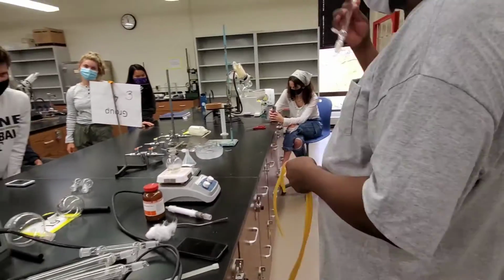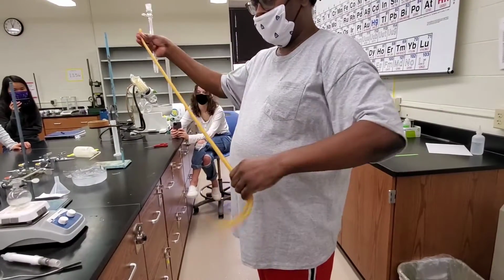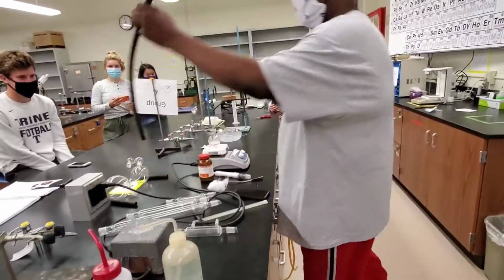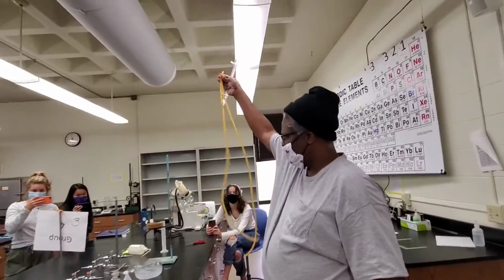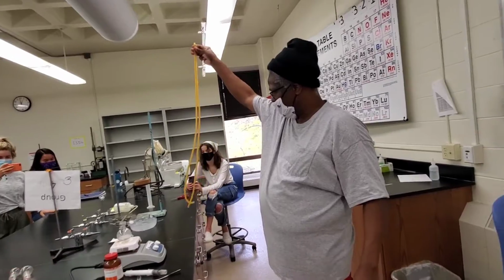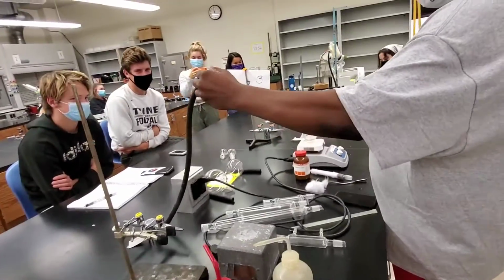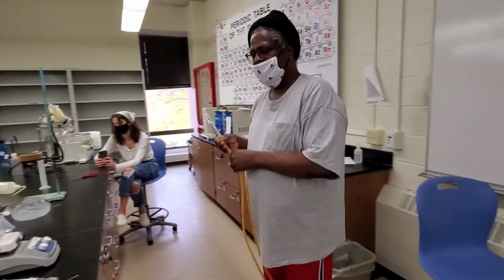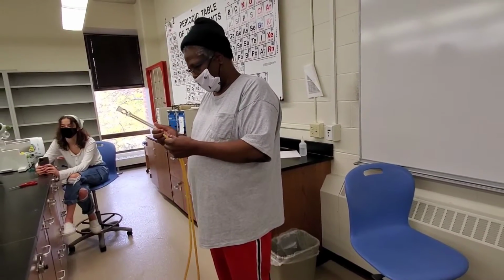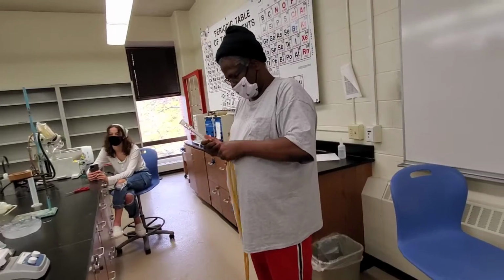All right, so for a condenser, you have to use rubber tubing. There are different types of rubber tubing. This is more flexible. It could collapse very easily. Here's this one. This is what you use for the condensers. These Tygon, amber looking tubing, this is what we refer to as a thick wall tubing. Those we would use when we're doing vacuum, but for using water and setting up your condenser, these are what you use.